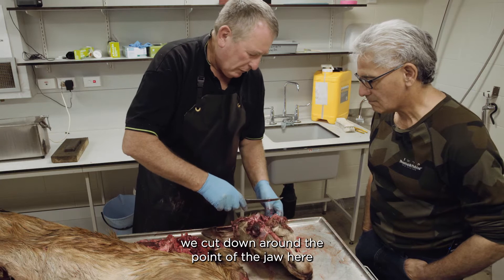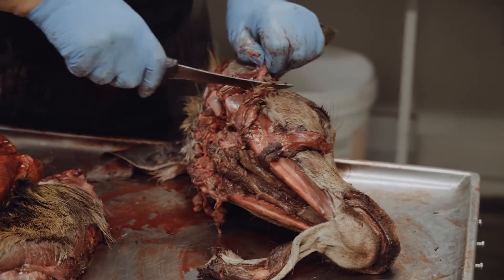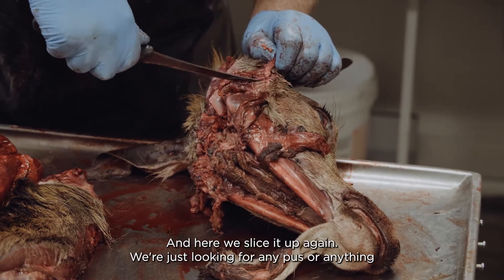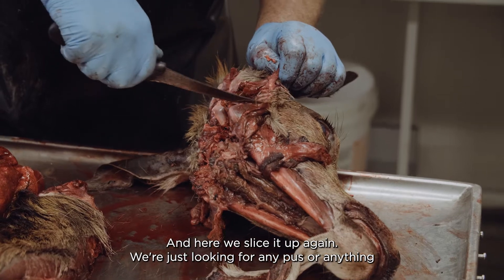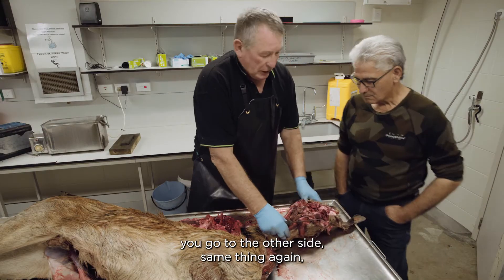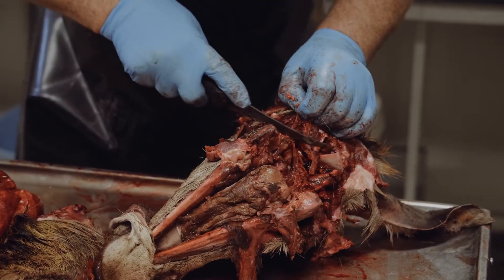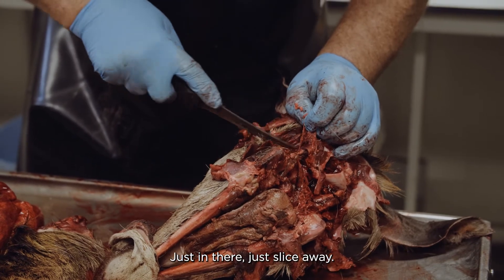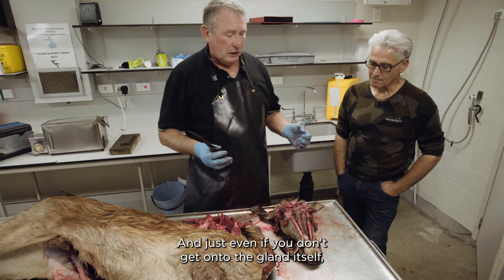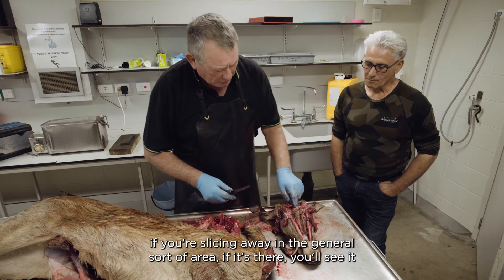We go round here and cut down round the point of the jaw, and just in there there's another gland - we slice it up again, just looking for any pus or anything. Then you go to the other side, same thing again. Just slice away in the general area, and even if you don't get onto the gland itself, if it is there, you'll see it.